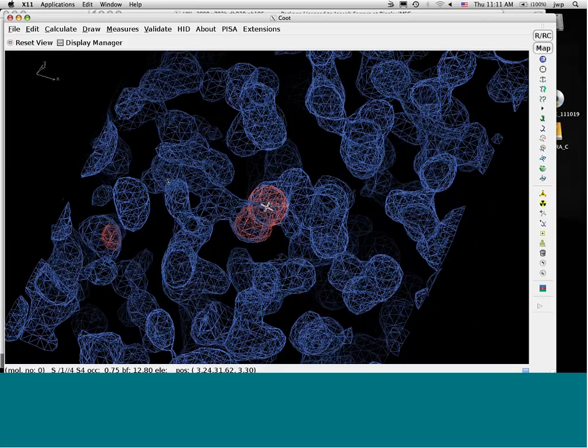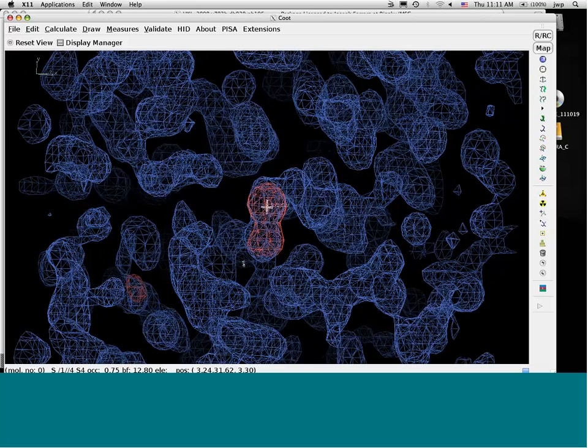So there's a question from ARCA, and the question is, can we handle severely twinned data having significant crystal slippage? And this is in their case, they've collected cobalt SAD data, and it sounds like it's going to be challenging.